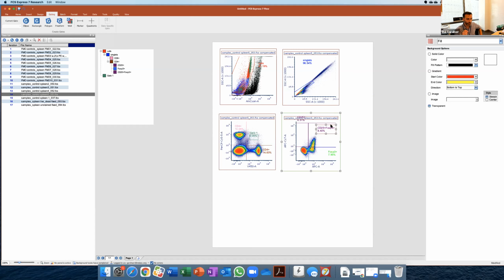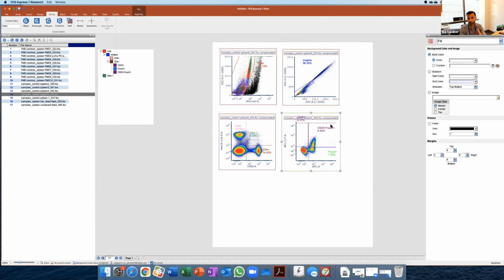I hope you understand, this is a very important distinction, because you have to look at your data and realize that you are not resolving the whole population.